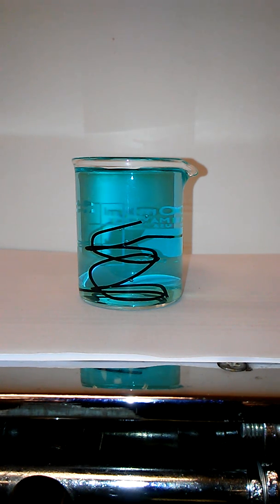So one of these two is the actual formula. I believe it's probably the first one, but I don't know for certain. We can do the test once it's done to figure out whether it's iron 2 or iron 3, but we're not going to.